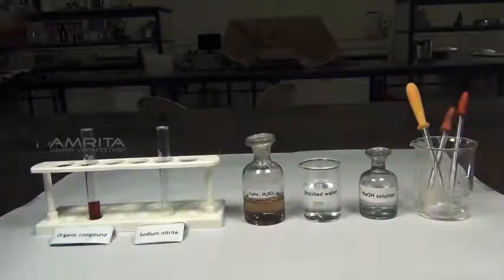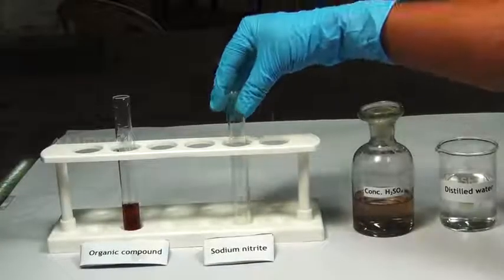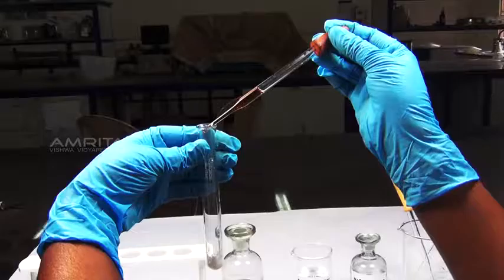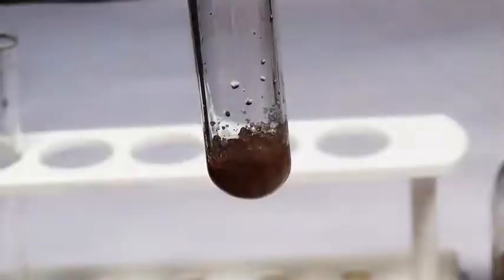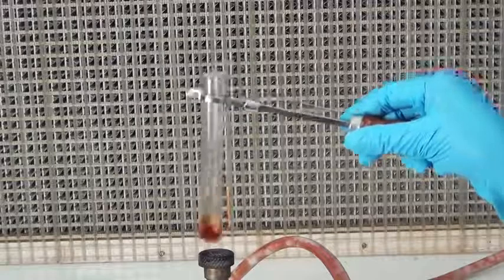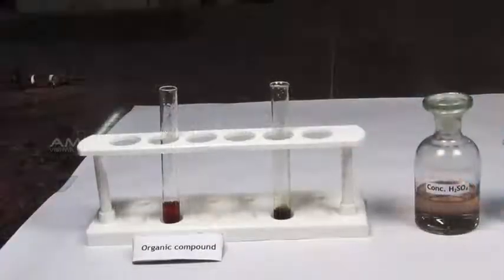Procedure: take a small quantity of sodium nitrite crystals in a test tube. Using a dropper, add a small quantity of organic compound to the sodium nitrite crystals. Heat the contents of the test tube gently over the Bunsen burner and allow it to cool.